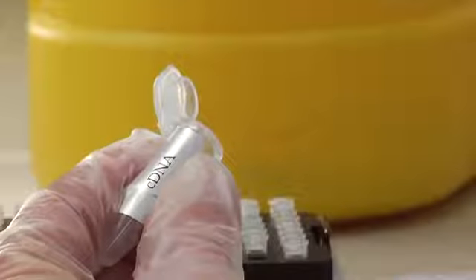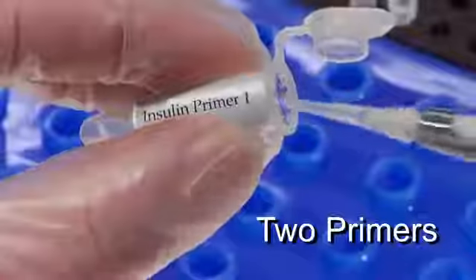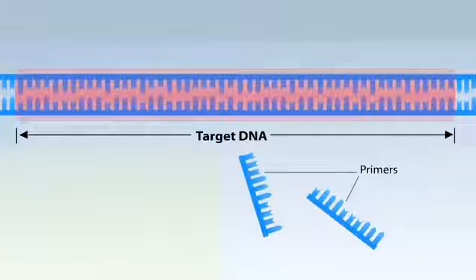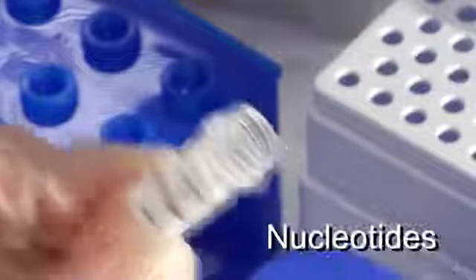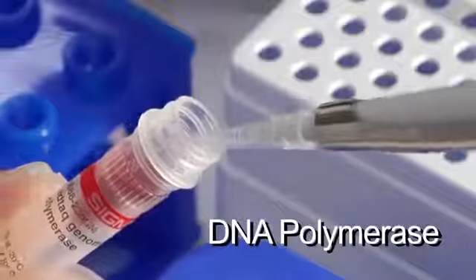To prepare the reaction, we take a sample of the cDNA template that we made earlier. We then take a sample of each of the 2 primers that are designed to only anneal to either side of our insulin gene. Each primer is complementary to each of the different strands of the double-stranded DNA. We take a sample of some nucleotides. We'll add the all-important DNA polymerase. The polymerase enzyme extends the primer with nucleotides to copy the DNA template. A quick mix and let the thermocycler do the work.